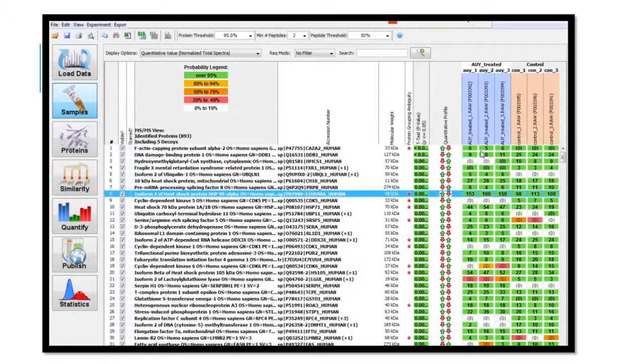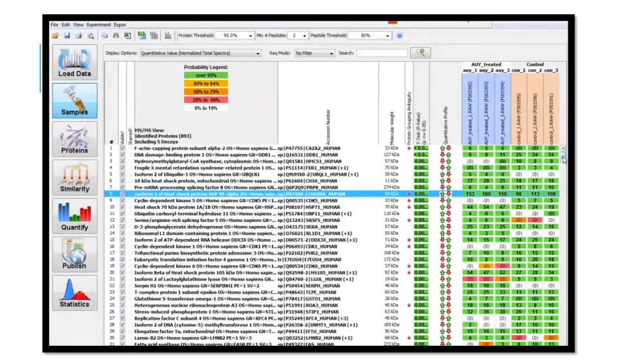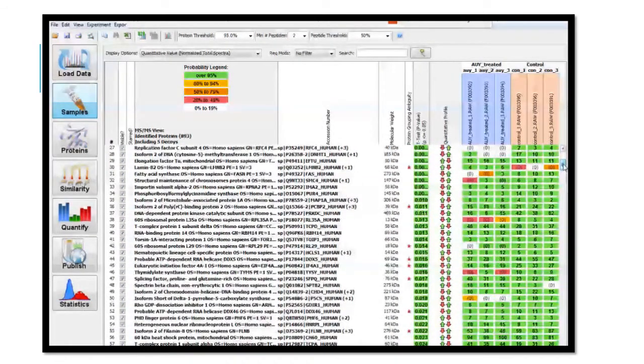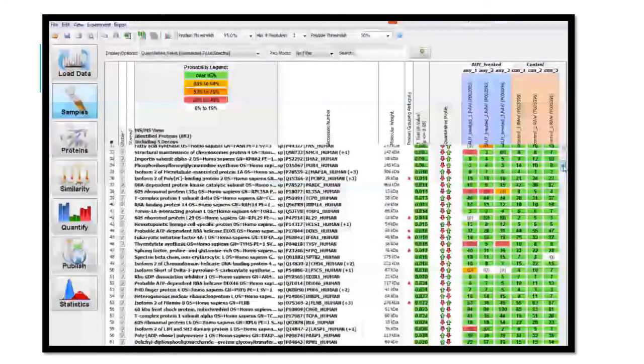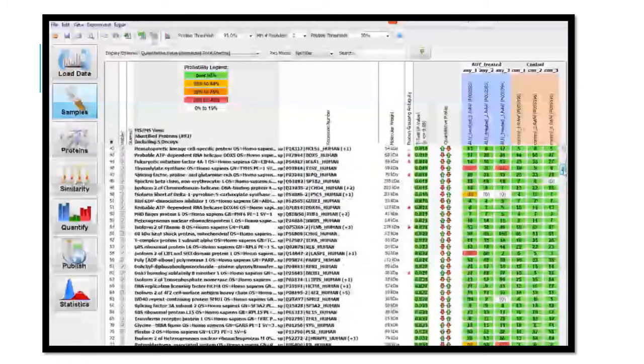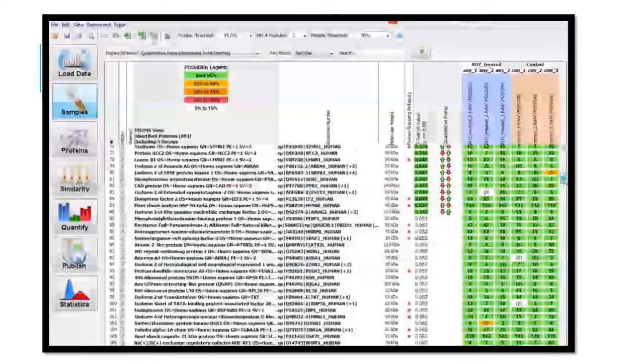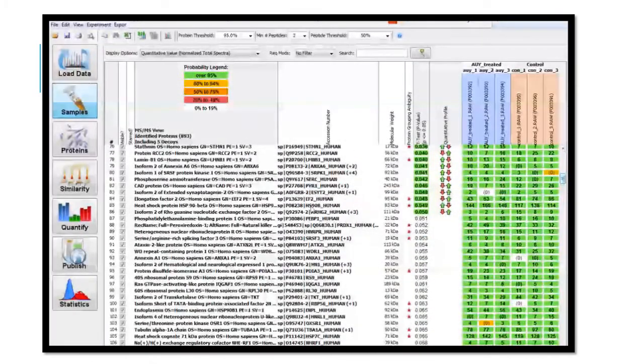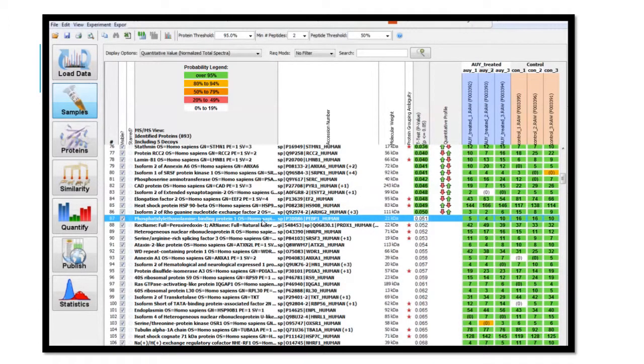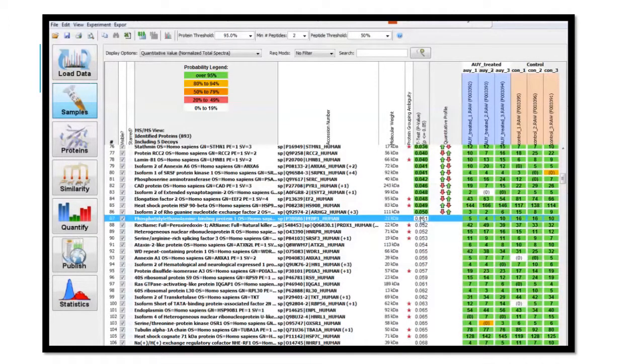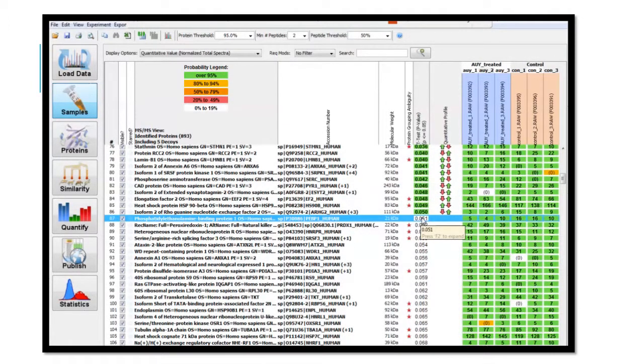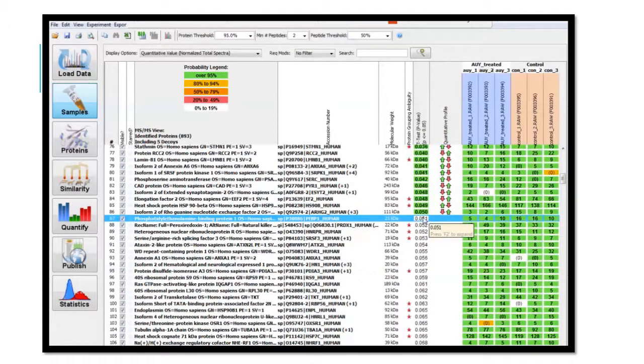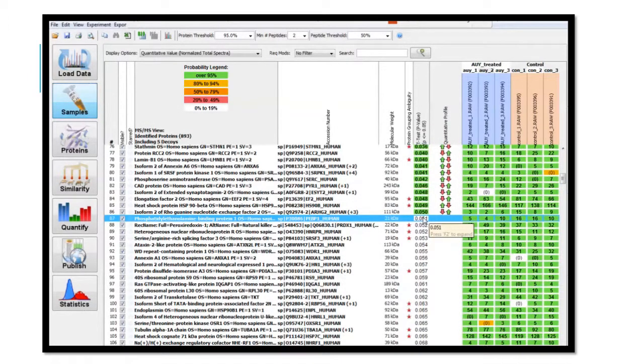I will select a protein that is not statistically different to show you an example. I have chosen phosphatidylethanolamine binding protein 1. It doesn't pass our student's t-test value criteria of having a p-value of less than .05. Therefore, this is simply an example of how to interpret the data.